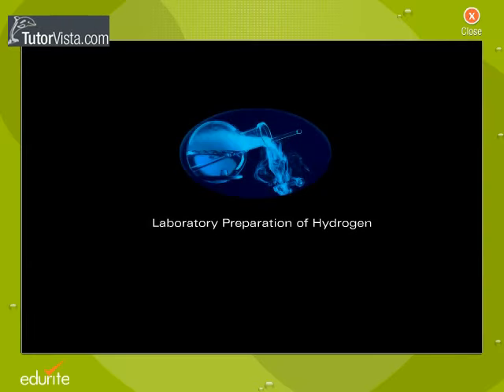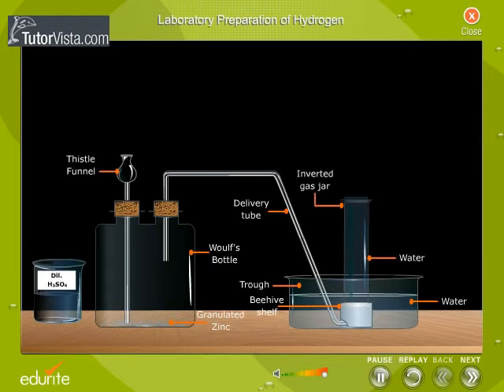Laboratory Preparation of Hydrogen. The apparatus required for the preparation of hydrogen is arranged as seen here. Hydrogen gas is prepared in the laboratory by the action of dilute sulphuric acid on zinc granules.